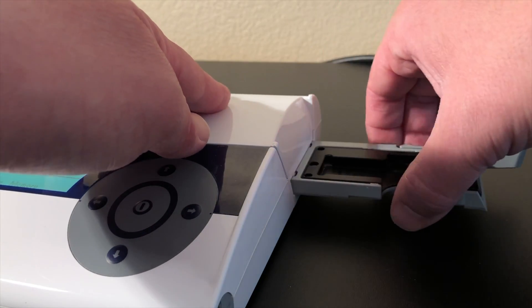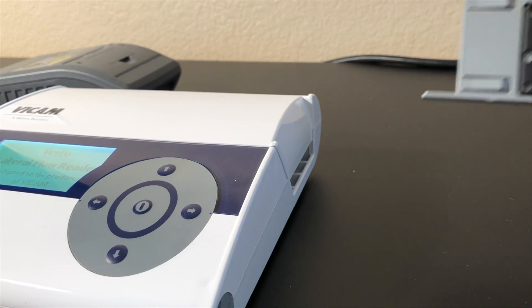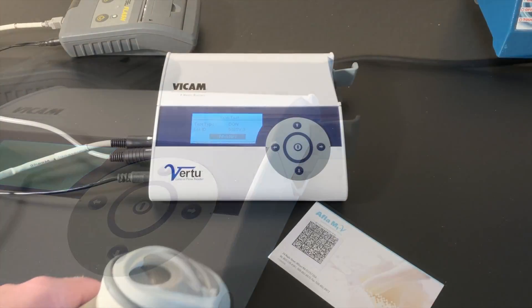The Virtu Reader is capable of running multiple tests for a variety of commodities, including animal feed. Gently pull and remove the cassette reader drawer and insert the strip test reader drawer. Keep the cassette reader drawer safe for future testing.